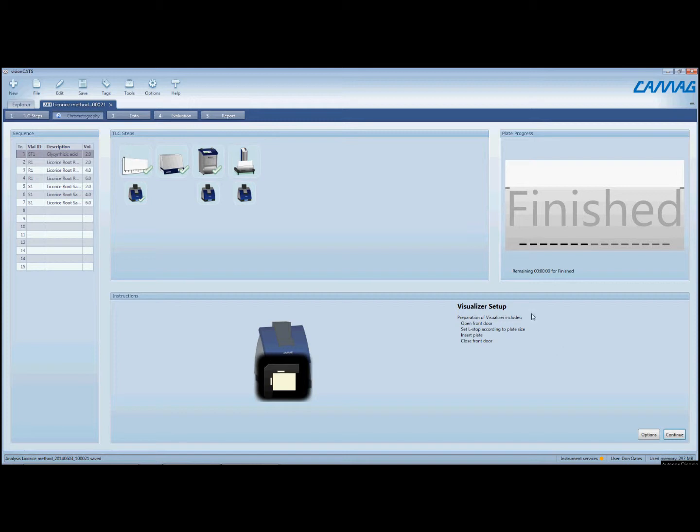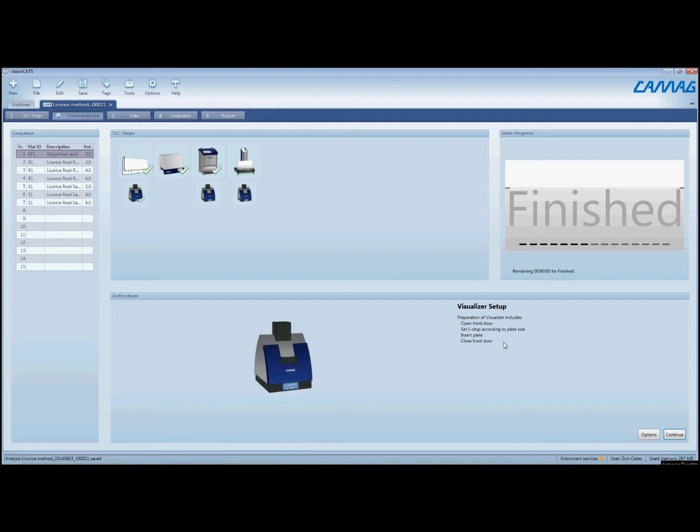Now we're going to move to the next step. As you can see, as before, the software is showing us what we need to do. We've inserted our plate, we've closed the front door.